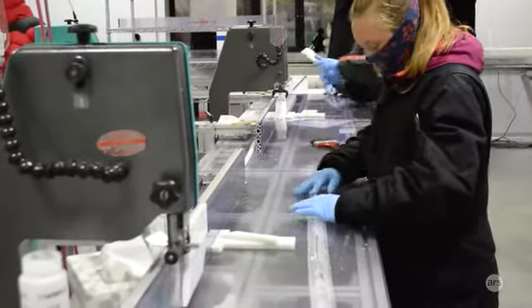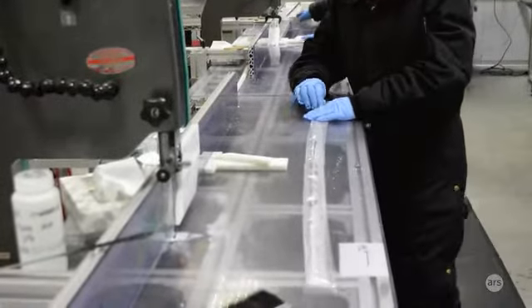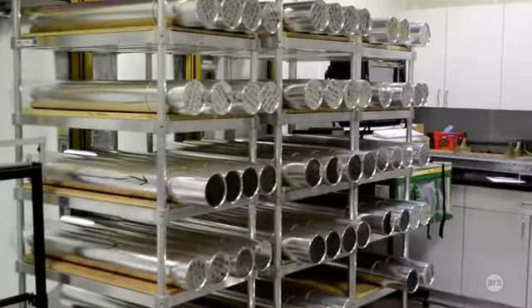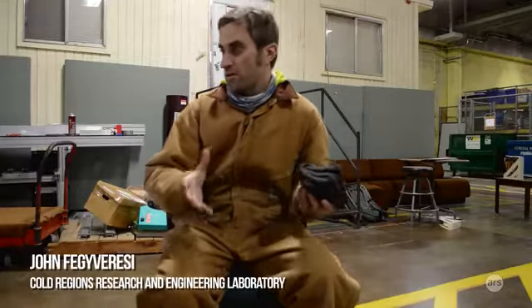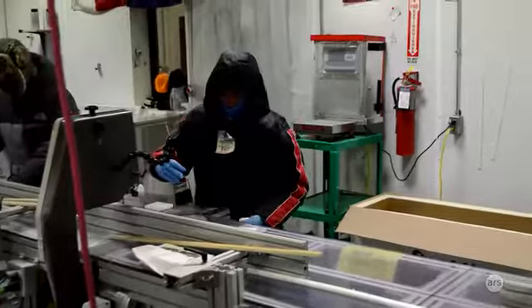Most people look at the gas concentration, they want to know how much CO2 is in the bubbles. But you could actually learn a lot just from the physical properties of the bubbles: how many, how they're spaced, how they're elongated, how they're oriented. Like at certain depths, the bubbles cause the ice to be really brittle, and then at certain depths, the bubbles disappear completely and it just becomes clear ice. So you can figure out different properties of the ice.